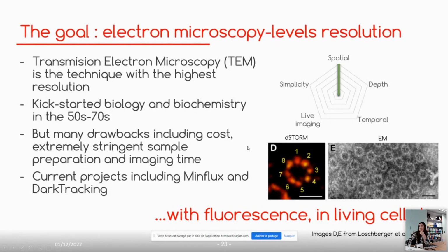So transmission electron microscopy is kind of this holy grail of spatial resolution. But that's kind of it. It did truly wonders for the biochemistry and biology world and history, but it does have a lot of drawbacks, including how expensive it is. In fact, the entire microscopy market is really dominated by how expensive these products can be. They require stringent sample preparation and lots of imaging time, and definitely the expertise.